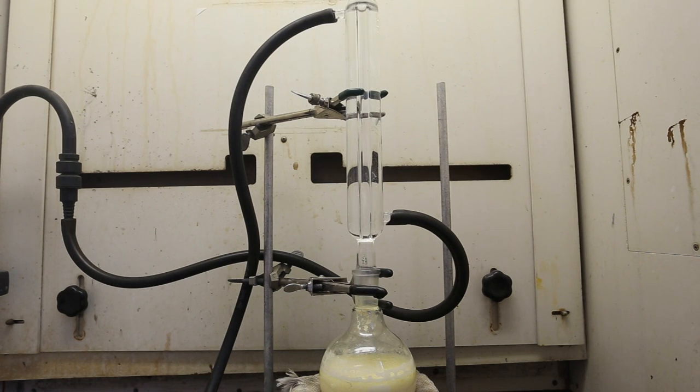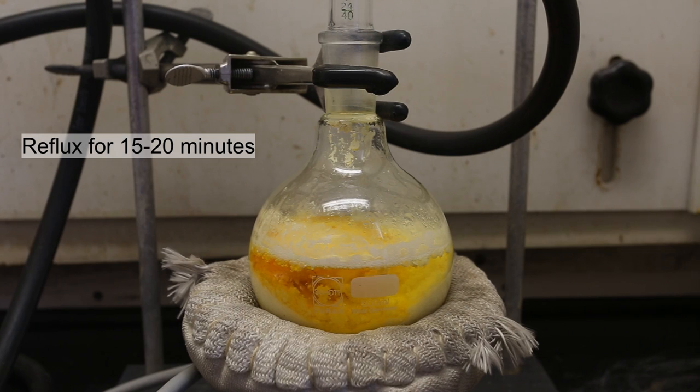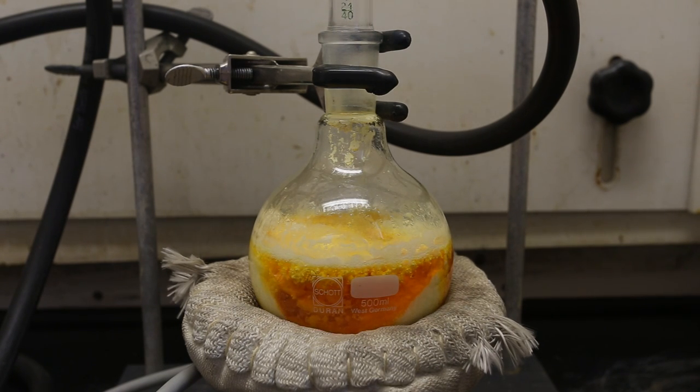Next, a reflux apparatus was set up. I used the heating mantle, but you could alternatively use a Bunsen burner. Because the solvent we're using is water, there is really no risk of lighting it on fire. Once your solution has come to a boil and you can actually see water condensing back down into the solution, then you can start your timer. You want to boil the solution gently for about 15 to 20 minutes.